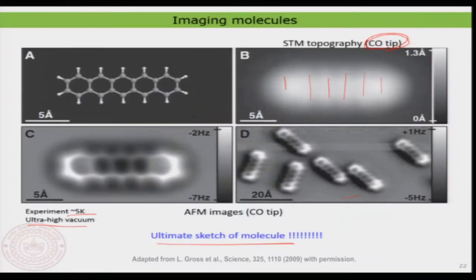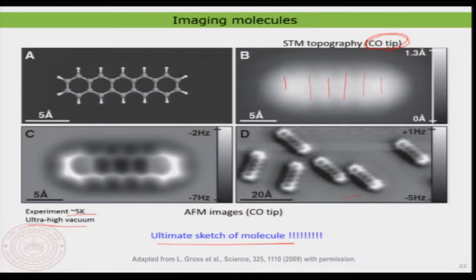Of course, something interesting I also want to draw your attention to in this molecule is that typically what you know is that the pi electron cloud is just moving across this hexagon, and that is what we have studied in our fundamental quantum mechanics classes, and that is something you can clearly see here. But you also see that the electron density is protruding a little away from the hexagon, and that is because you have that carbon hydrogen bond. So, now you see a little bit more than what you have studied. It is not just the electron density localizing around the hexagon, it is also a little bit leaking out through the hydrogen. That is something you would expect, because between hydrogen and carbon there is an interaction.